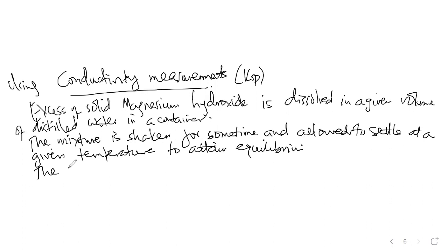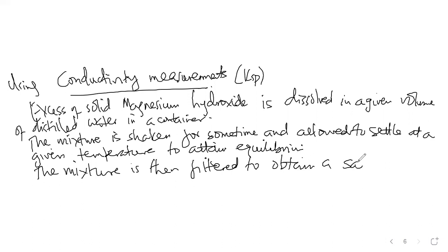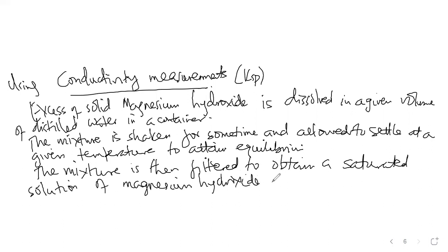The mixture is then filtered to obtain a saturated solution of magnesium hydroxide as filtrate.